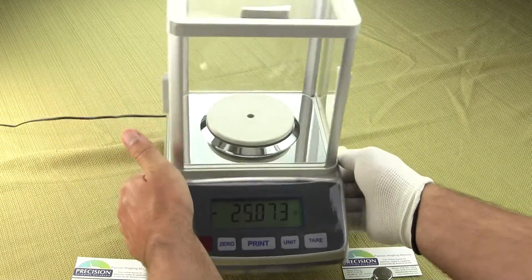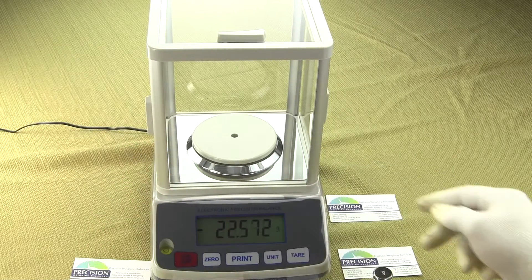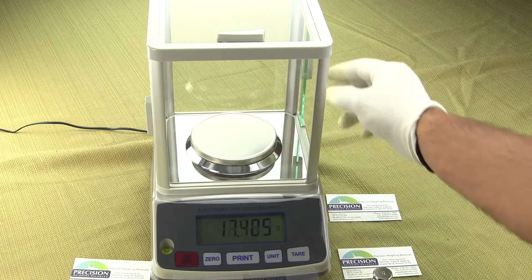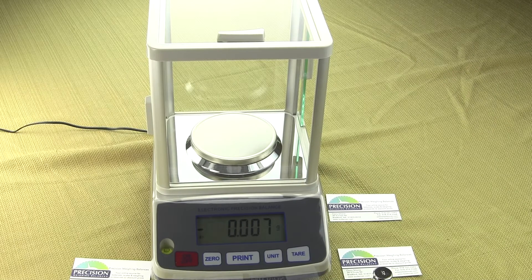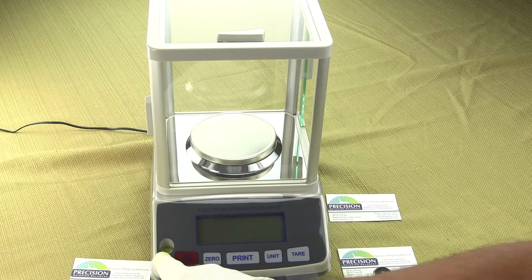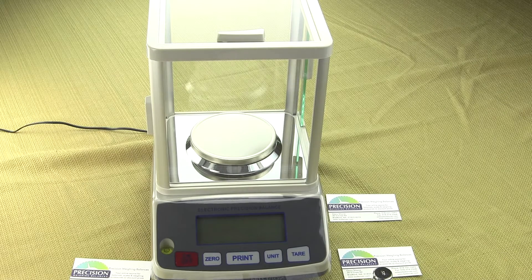It's a very basic milligram balance, low cost, and this is a strain gauge balance — similar to the Aculab VIC-123 and the Sartorius AY series. To calibrate the balance, calibration is simple but a little different compared to most balances. You do have to shut off the balance first. Make sure the balance is level — the spirit bubble is in the center — then turn on the balance. It does the power-up sequence, counts down, and eventually the display will show a series of dashes. At this point, hit the zero key.